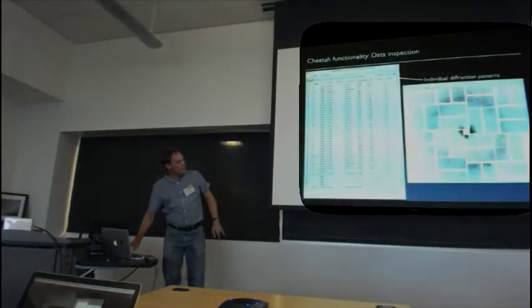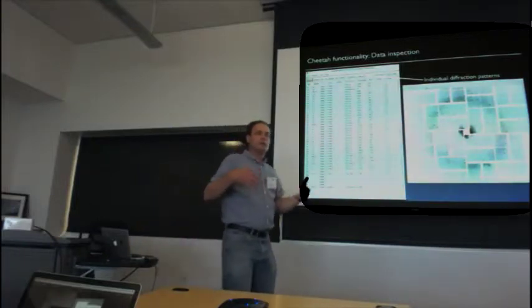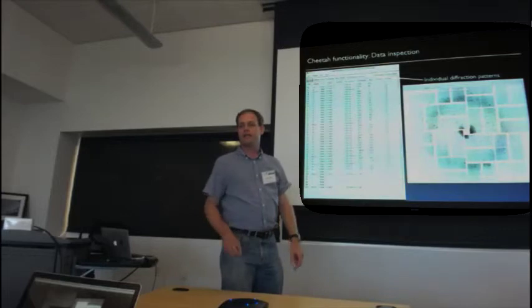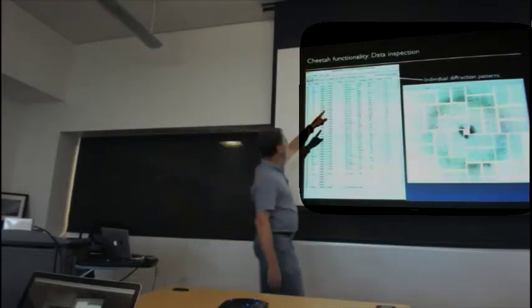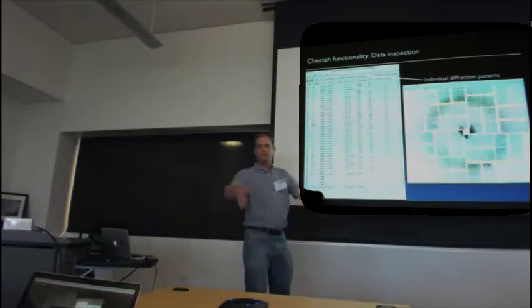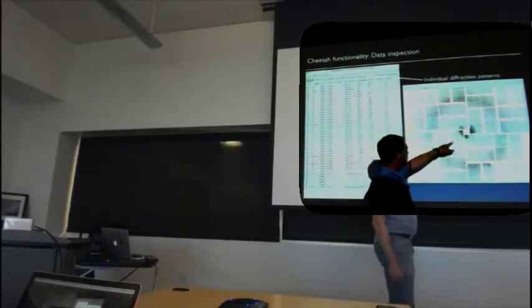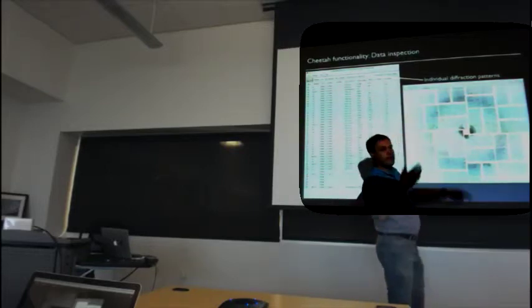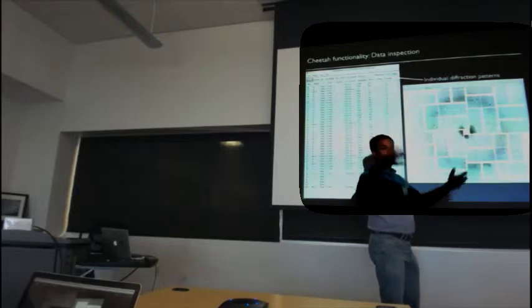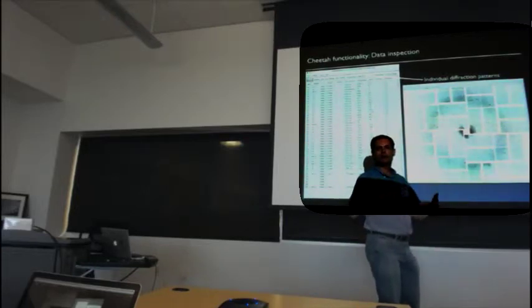And then one of the most useful things, of course, is crystallographers have a good intuitive feel of what a good diffraction pattern looks like, and the first thing they want to do is, what does my data look like? So you click on the button up there, view hits, pulls up a separate viewer, circles the Bragg peaks that were found so you can see what the Bragg peak finding is like, and you just click through one image per second and look at 100, 200 images, and you get a rough idea of a feeling of what your crystals are actually diffracting like. Just shows you the hits.